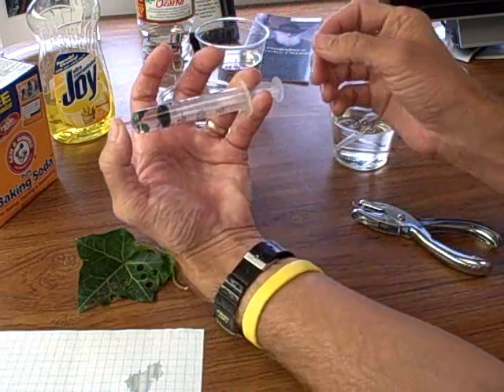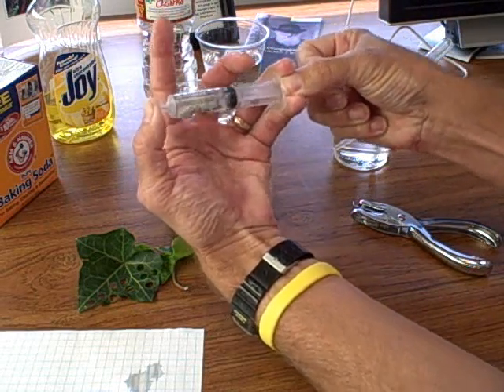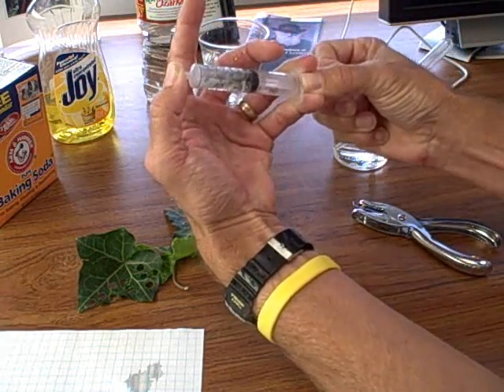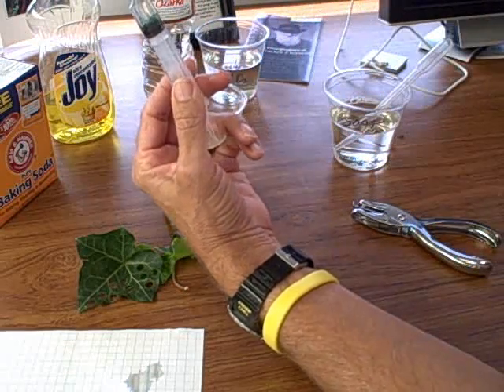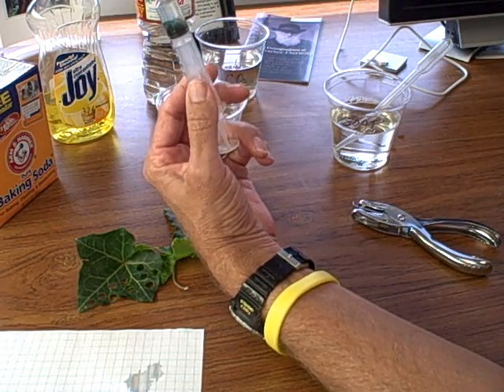I've got this suspended between my fingers with my thumb over the end. I'm going to use my thumb to help pull the plunger down. I shake it around a little bit, then let it go — and look, that didn't even need soap! Soap is sometimes critical and sometimes not, but this time I didn't need it, so it worked really well.